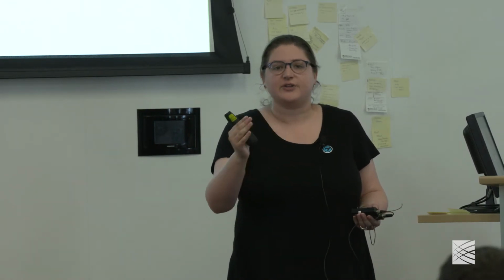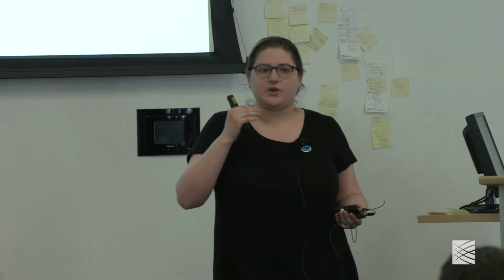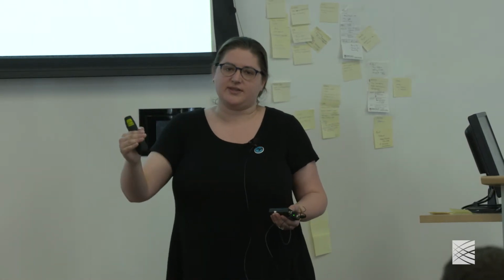I think it's important to comment that the panel of normals isn't just about the population, it's also about the technology that you're running as well. So the normals should be run with the same sequencing machine, the same sequencing chemistry. Just to repeat, the technology that you're sequencing with is really important. You're trying to filter out sequencing artifacts. So in order to do that, you need a panel of normals that is run on the same technology.